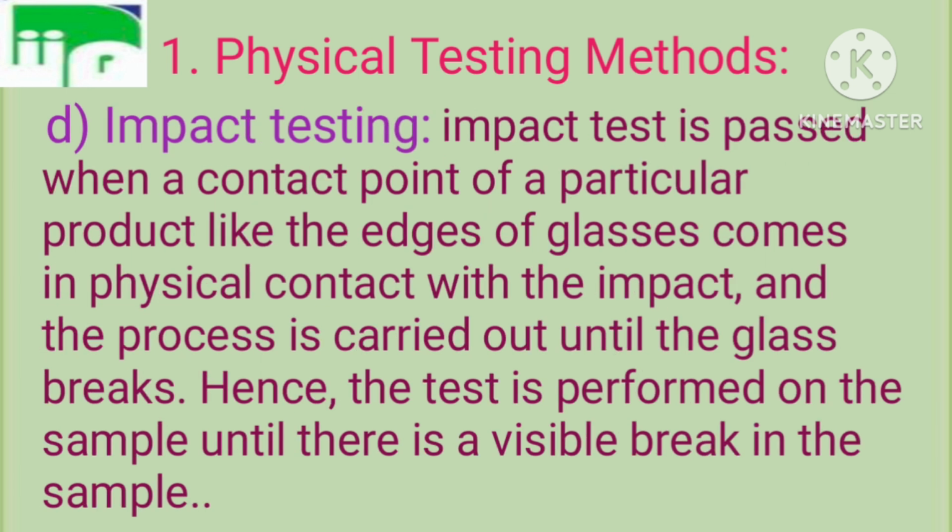Impact testing. Impact test is performed when a contact point of a particular product, like the edges of glasses, comes in physical contact with an impactor and the process is carried out until the glass breaks. Hence, the test is performed on the sample until there is a visible break in the sample.